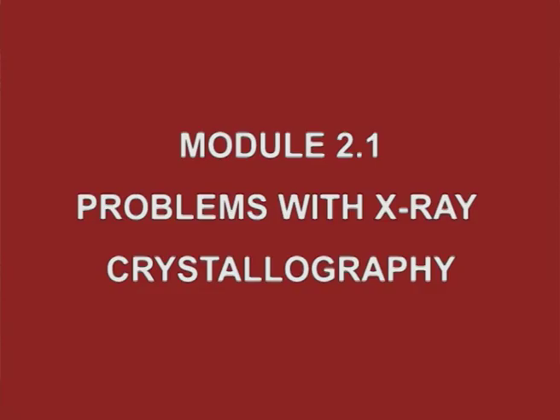Module 2.1: Problems with X-ray crystallography. Locating hydrogen atoms. Hydrogen atoms make extremely small contributions, and for this reason X-ray crystallography is not a good technique for accurately locating hydrogen atom positions.